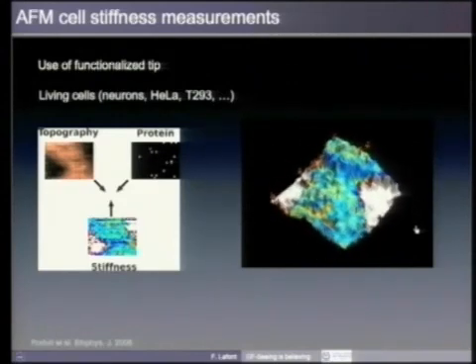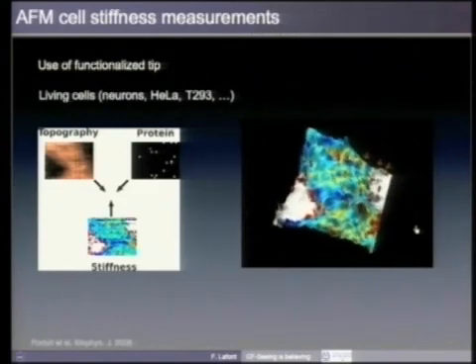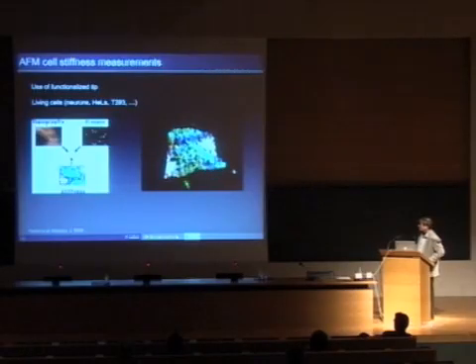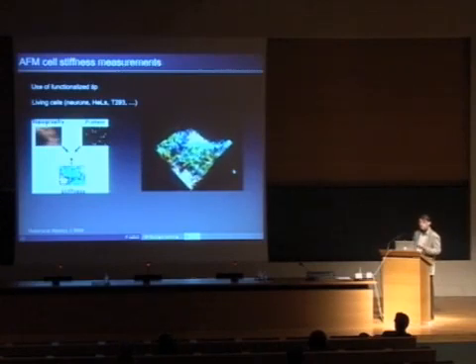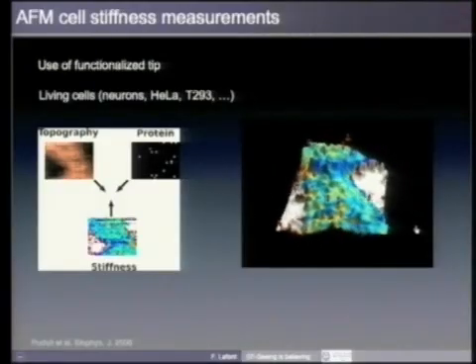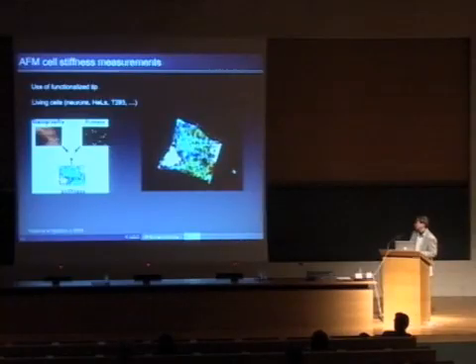And the red arrows indicate where we've got interaction between GPI proteins and aerolysin. Following this information, you can know whether you have interaction more on stiff domains or soft domains. And this is interesting if you are studying membrane heterogeneity on the cell surface. I will come to this point in 2 slides.